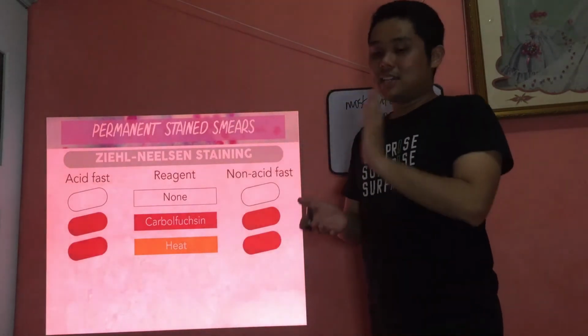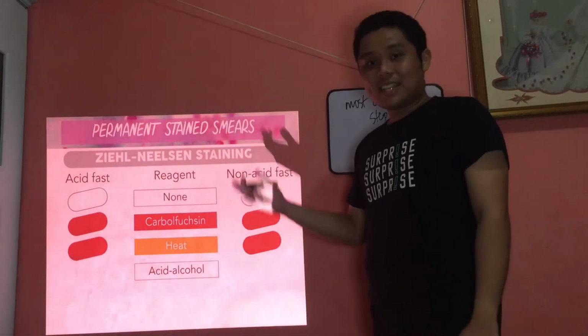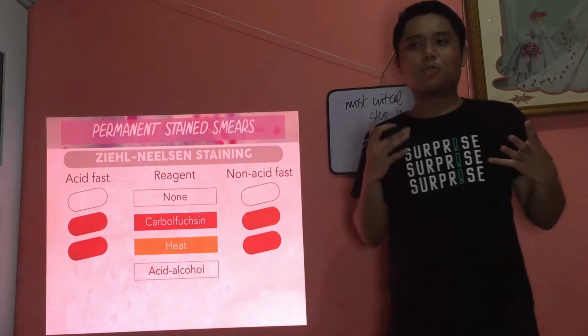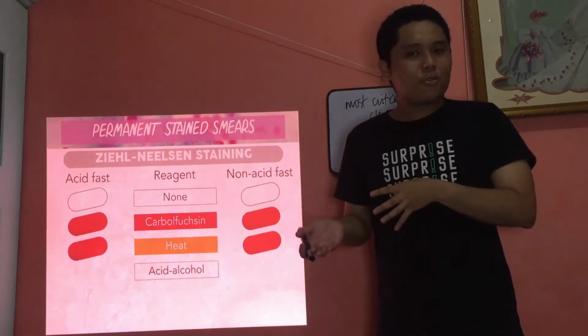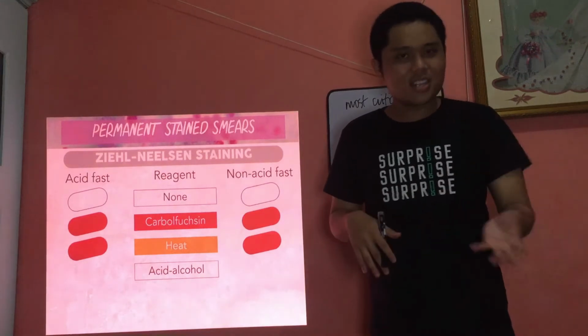Ayan, nagets lang. Now, this is where the magic happens. O, diba? Acid alcohol is a decolorizer. So what happens, diba? Decolorizer. So siya ang third party. Siya ang test sa relationship between carbofuchsin and the organism. Is it really strong? Are you really true acid-fast? Are you or not? Are you a partially acid-fast or are you a non-acid-fast good?